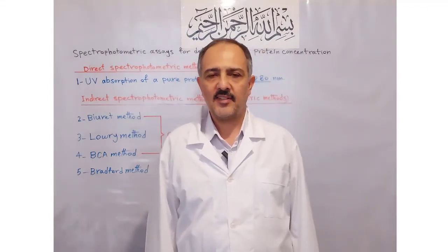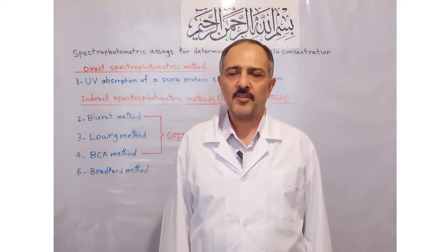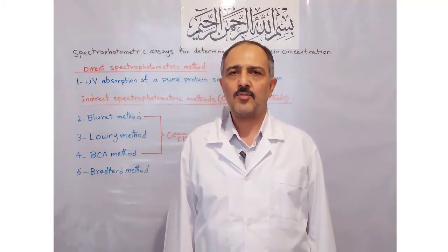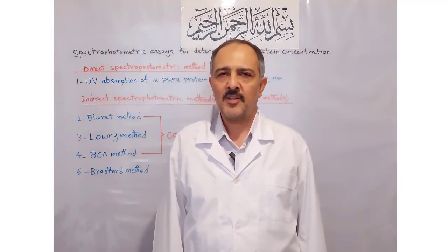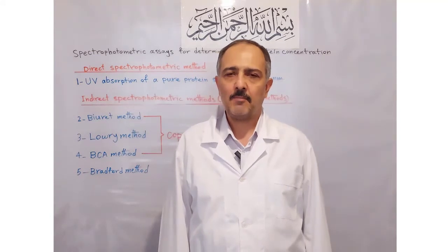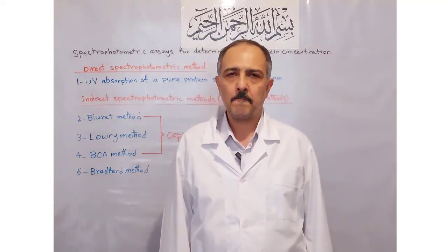The selection of a protein standard is potentially the greatest source of error in any protein assay. Of course, the best choice for a standard is a highly purified form of the predominant protein found in the samples. This is not always possible nor always necessary.